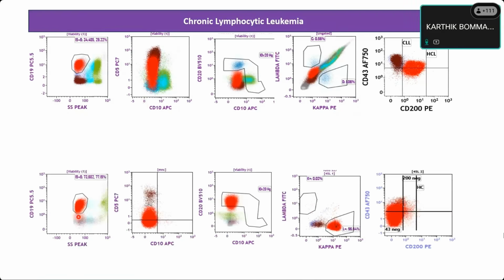Dr. Ruchika, CD19 expression? CD19 positive. And CD5? CD5 is also positive, negative to dim expression, right? And CD20?